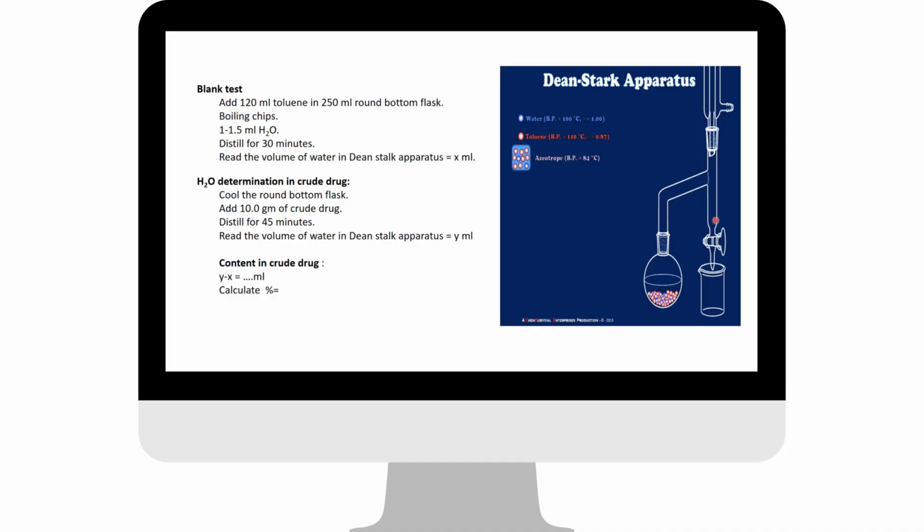In this case, the reading will be more. Why? Because the drug may contain some moisture, which will also vaporize, and this makes the reading higher, right? So this measurement will definitely be higher. If you measure this aqueous layer again, you should note it down as Y.